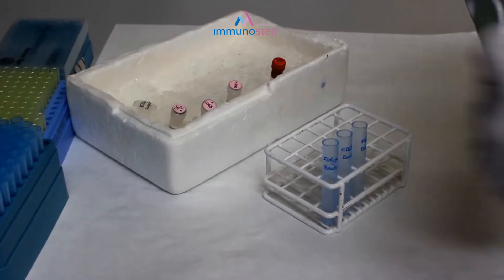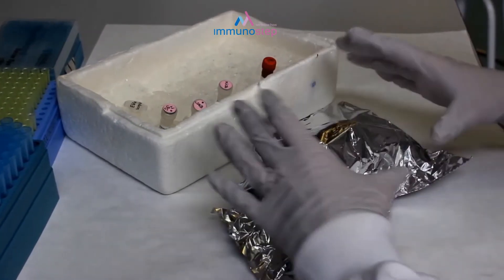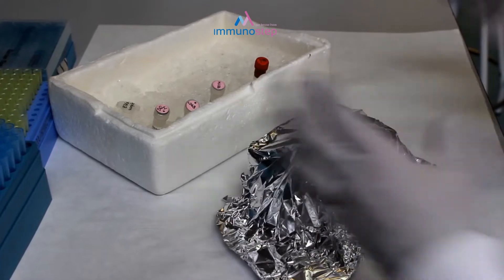Then we cover the tubes from light and incubate the mix at room temperature overnight.